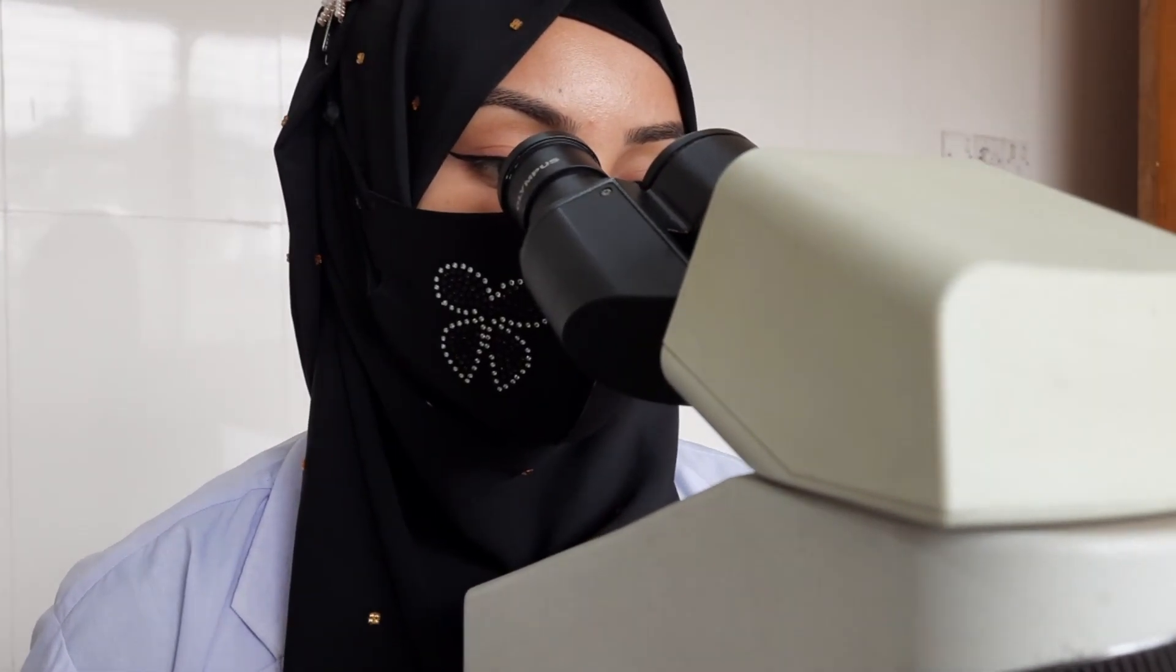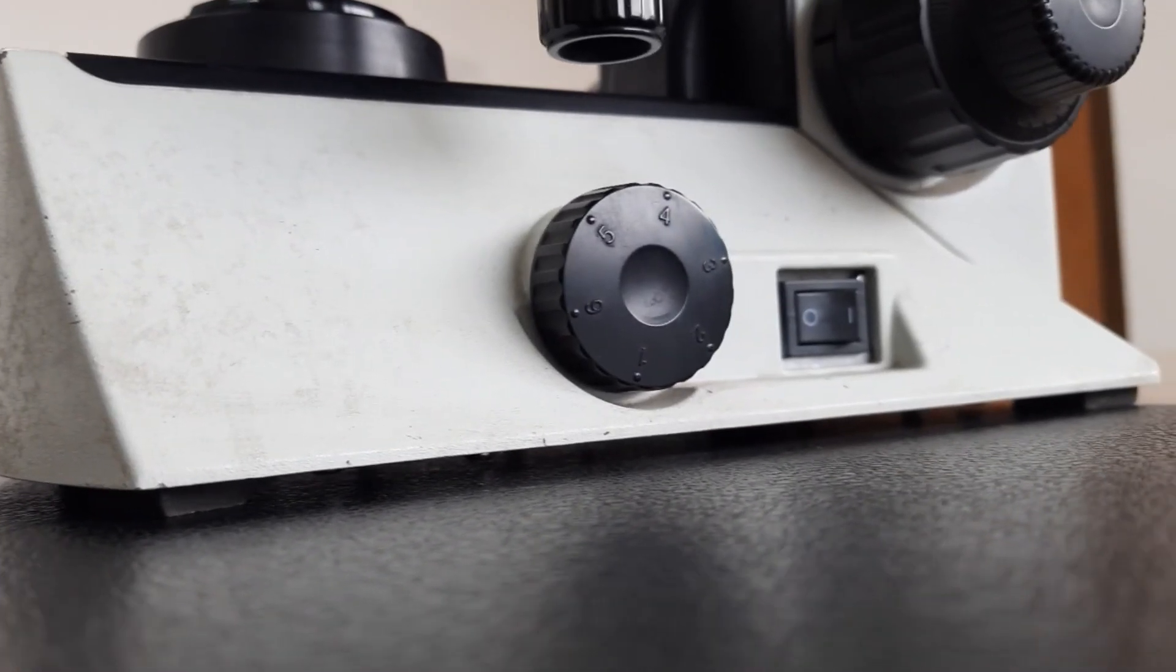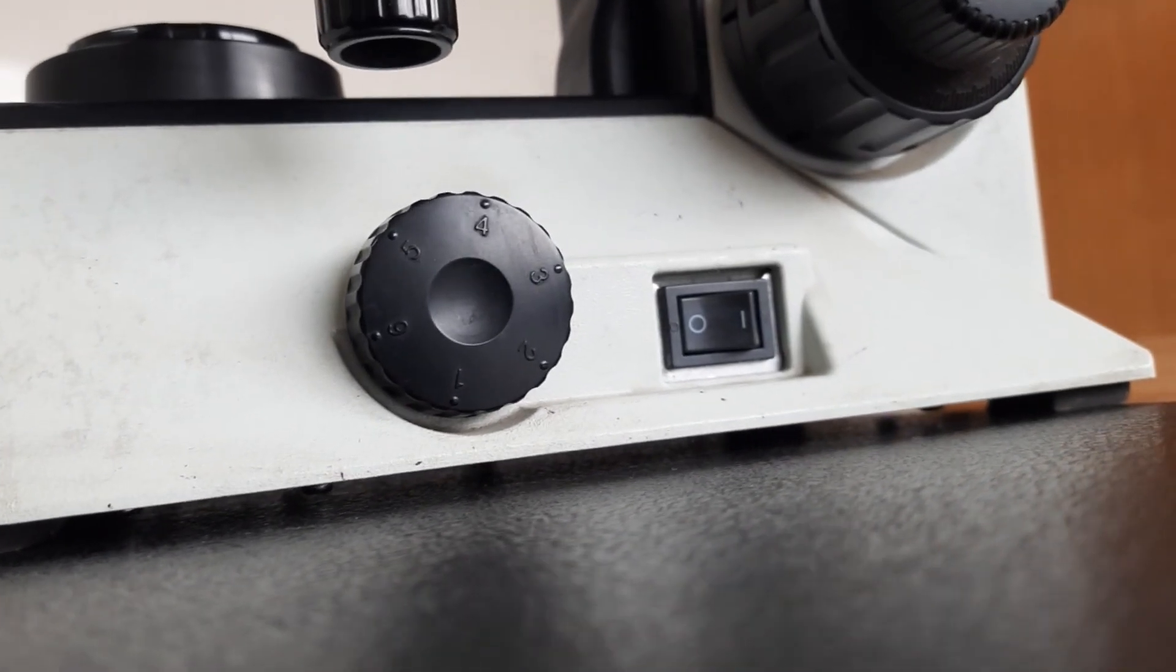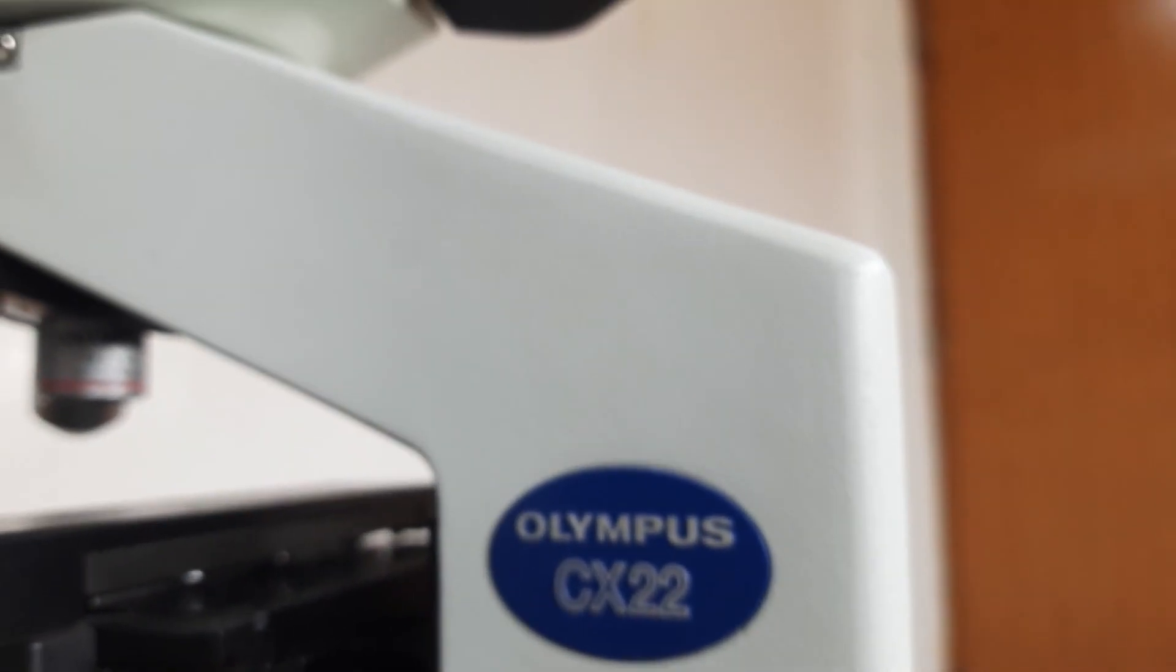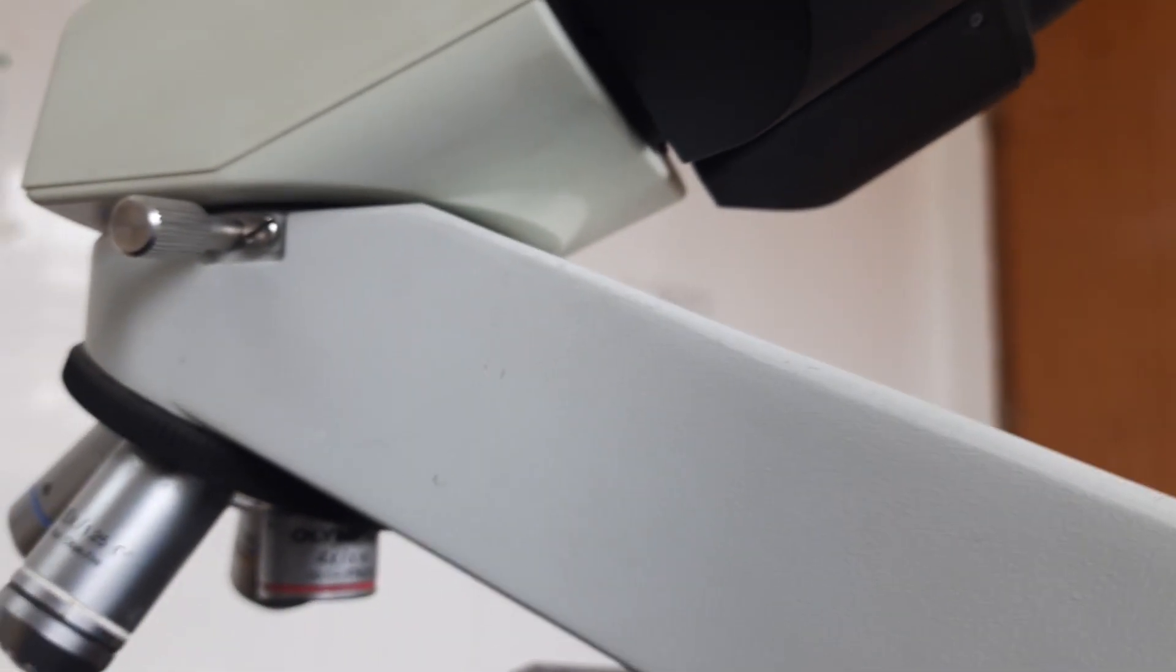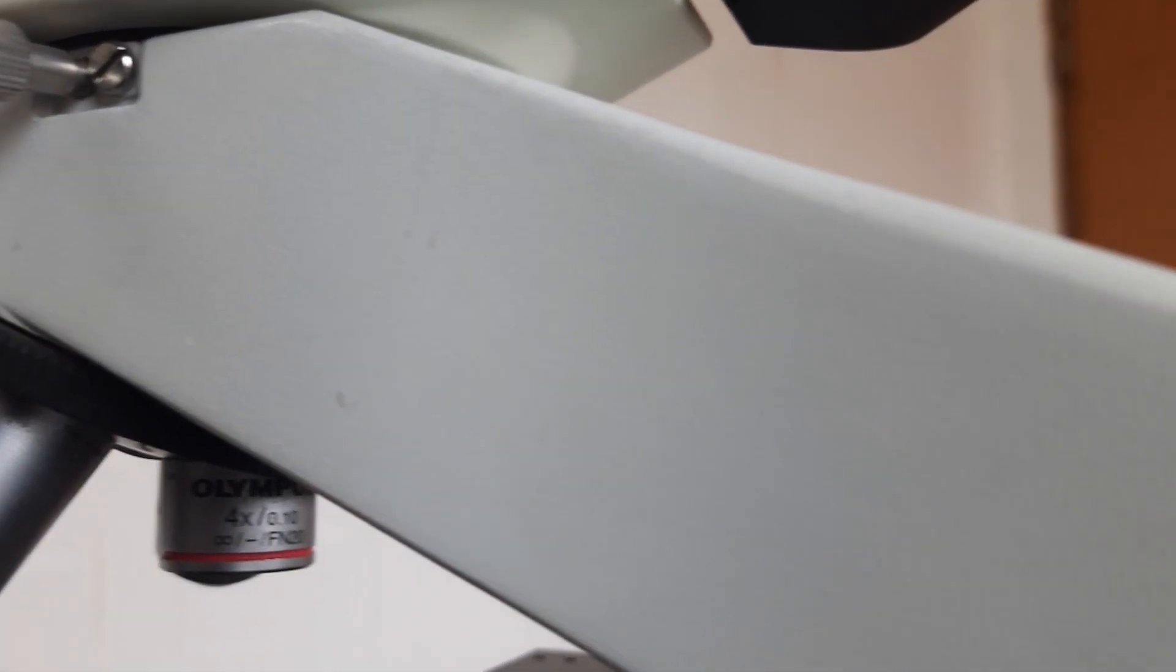The base is what the microscope sits on. It provides stability and support for the entire instrument. The arm is the curved or straight vertical part that connects the base to the head of the microscope. It allows you to carry and hold the microscope securely.